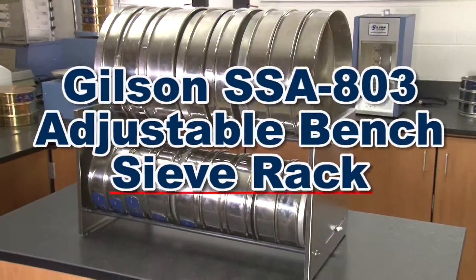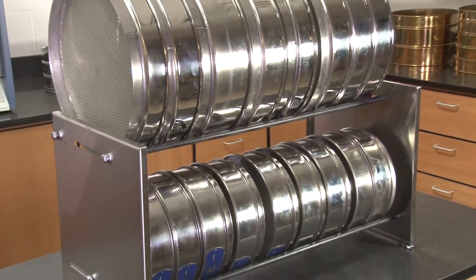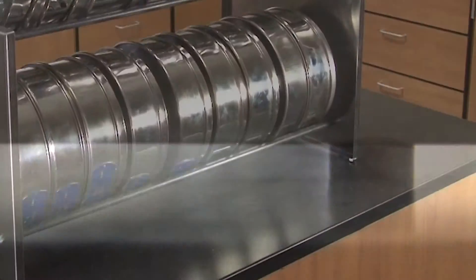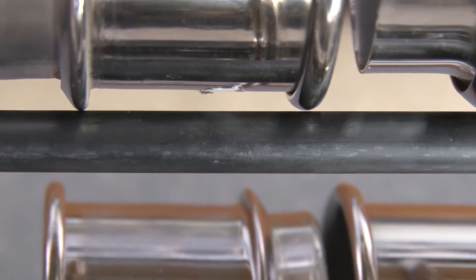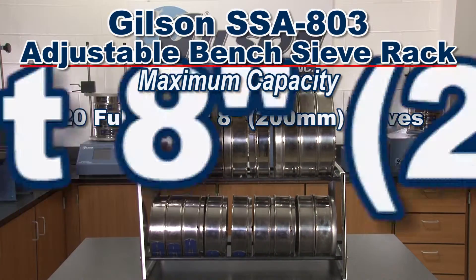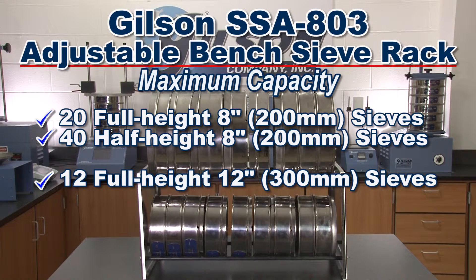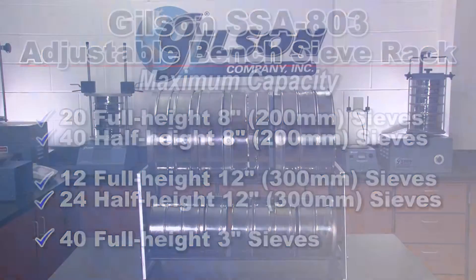The Gilson SSA 803 Adjustable Bench Sieve Rack holds all diameters of test sieves up to 12 inches. This stainless steel rack has non-skid rubber feet and is supplied with two permanent and two adjustable rubber-coated sieve support rods to accommodate up to 20 full-height 8-inch sieves, 40 half-height 8-inch sieves, 12 full-height 12-inch sieves, 24 half-height 12-inch sieves, or 40 full-height 3-inch sieves.